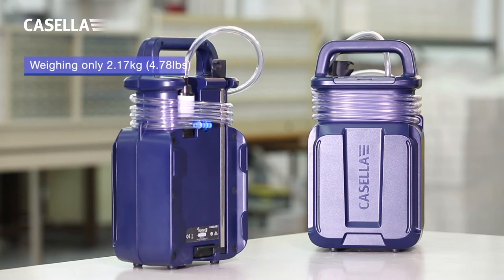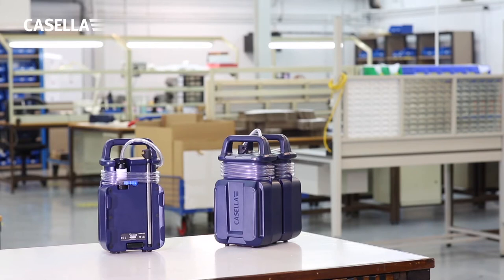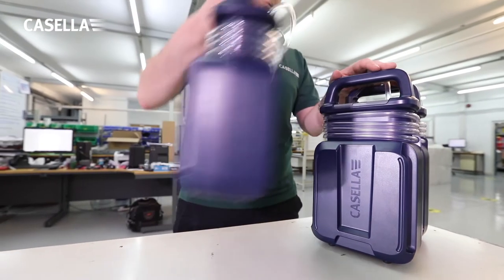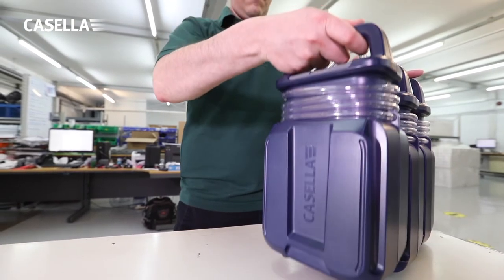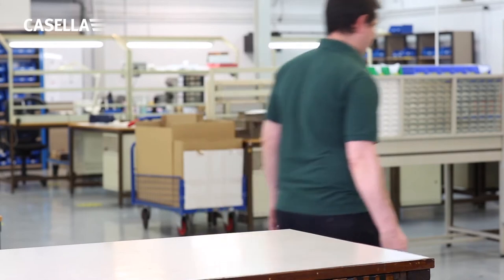As well as being very lightweight, the Vortex 3 has a unique interlocking mechanism which enables a number of pumps to be connected together, making them easier to carry and distribute around a site that requires multiple flow samples to be performed.